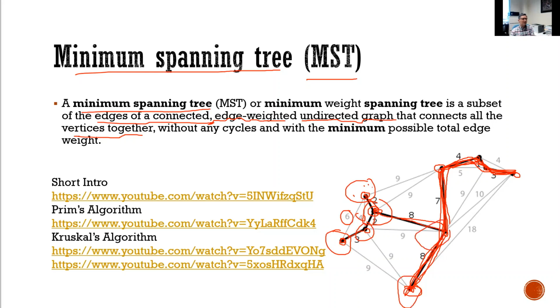Then you calculate the distance between centers, reconstruct this minimum spanning tree, and based on the tree, you find the major trajectories. If you want to study another secondary trajectory, you can go from another path. Okay, so this is one algorithm.